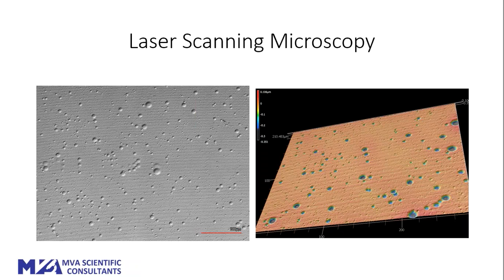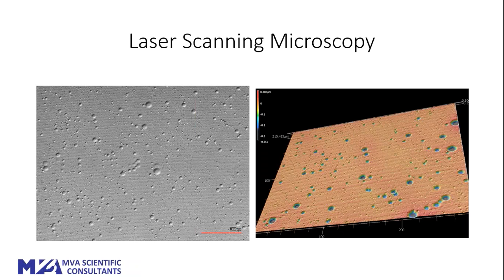This set of images shows two views from the laser scanning microscope. On the left, some features might look like bumps on the surface, but looking at the image on the right it becomes clear that those circular features are actually pits. You can see the depth based on the scale bar in the upper left of that second image — it looks like the pits are about 2.2 microns deep.